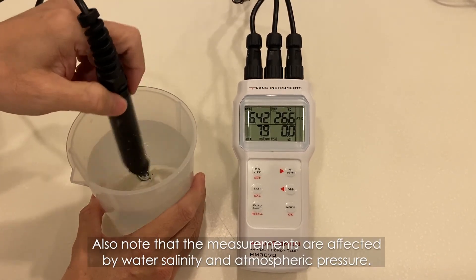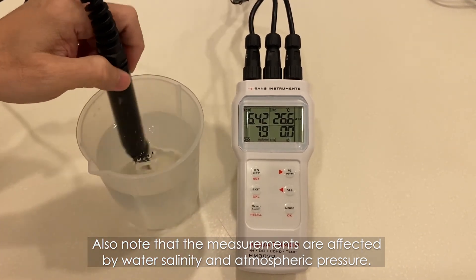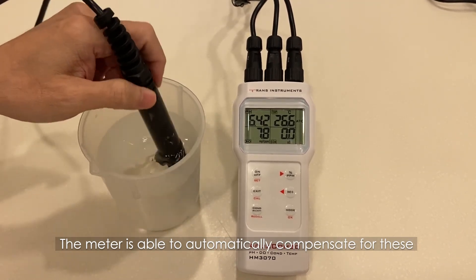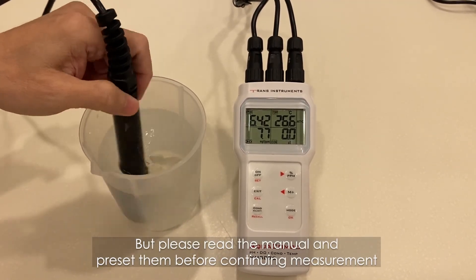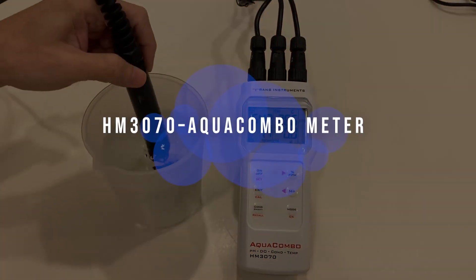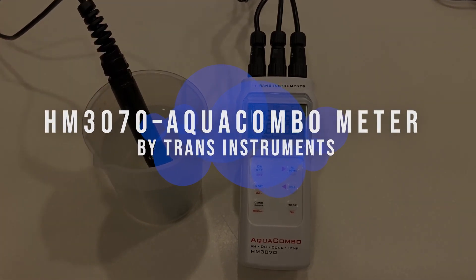Also, note that measurements are affected by water salinity and atmospheric pressure. The meter is able to automatically compensate for this, but please read the manual and preset them before continuing measurement. Hope you now have a grasp of the new HM3070 Aqua Combo meter. Thank you.